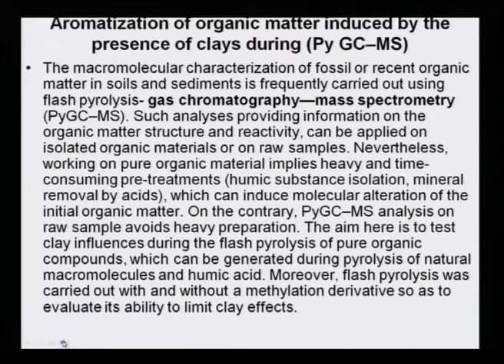Such analysis provides information on the organic matter, structure and reactivity, and can be applied on isolated organic materials or on raw samples. Nevertheless, working on pure organic material implies heavy and time-consuming pre-treatments such as humic substance isolation and mineral removal by acids, which can induce molecular alteration of the initial organic matter.